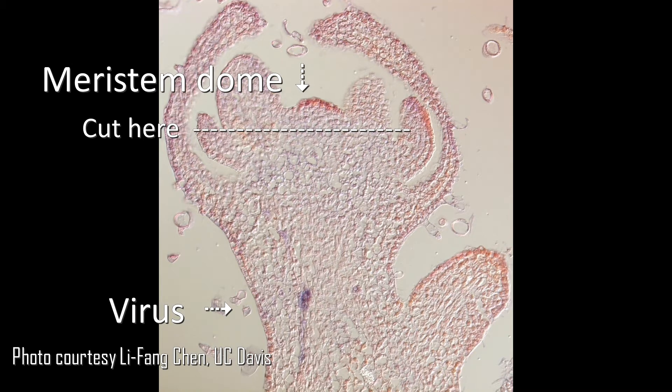The great thing about this photo is that it clearly shows that if you excise the meristem dome plus a few leaf primordia at the top, you've gotten away from the virus. Then you grow a whole new plant from the tip and have a clean mother plant to propagate from. This is one of the theories why tissue culture for virus elimination is a successful technique.